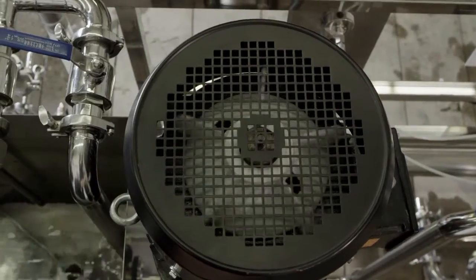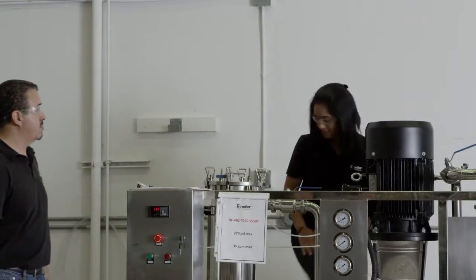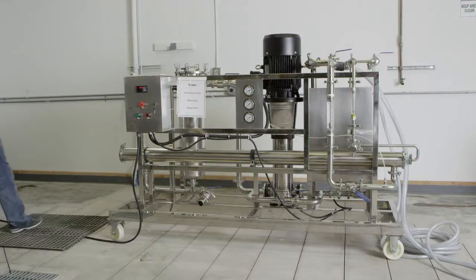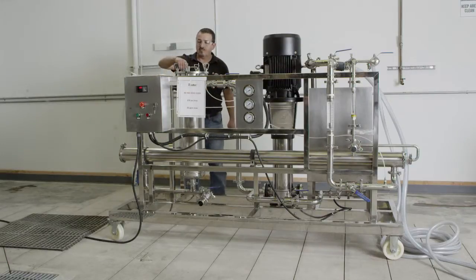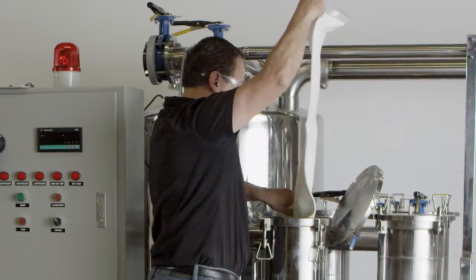All spiral wound membrane elements must have the proper pre-filtration to remove particulate matter that can damage or plug up the membranes. Ensure that the bag filters or cartridge filters are installed correctly prior to startup. For more information on how to properly change bag filters, see our Changing Bag Filters video.